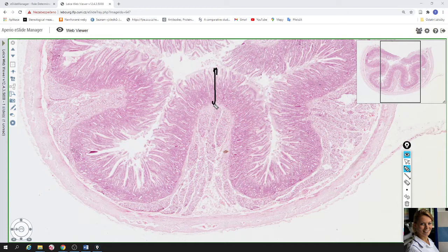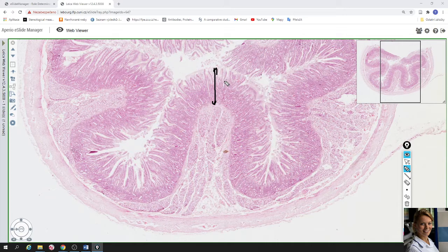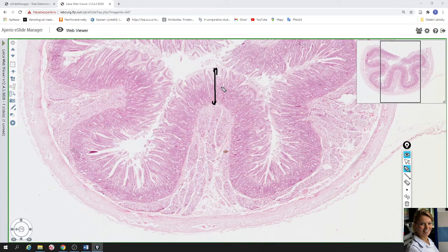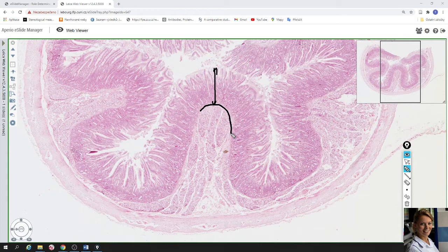The mucosa is composed of three layers. The first layer is lamina epithelialis — one layer of columnar epithelial cells. The next layer is lamina propria, which is loose connective tissue forming the core of the villi. The last layer of mucosa is a thin layer of smooth muscle cells called lamina muscularis mucosae.